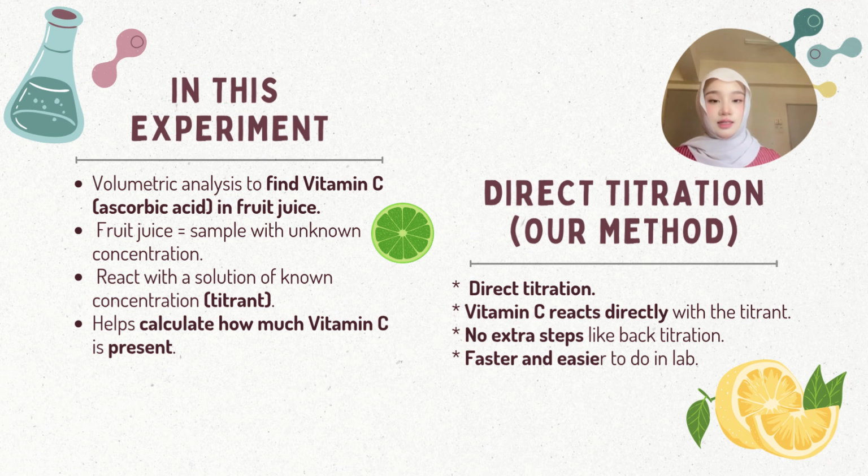Our chosen method is a direct titration. In a direct titration, vitamin C reacts directly with the titrant. This means there are no extra steps required, like in a back titration, making the process much faster and easier to do in the lab.